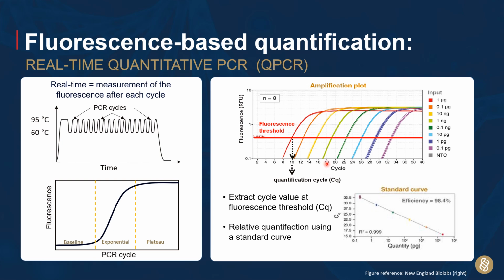We determine what is the CQ value of that unknown sample that we are trying to quantify, and plot that against the standard to determine what the concentration for that sample is. Thus, our unknown sample is quantified relative to the known standard, hence the name.